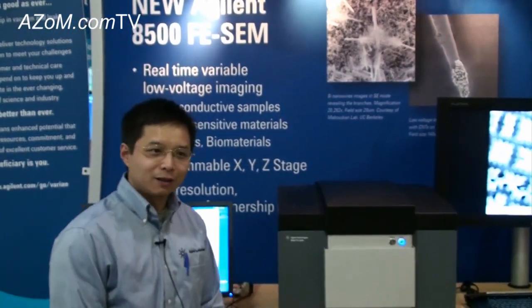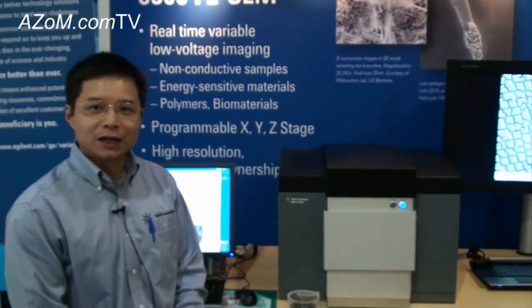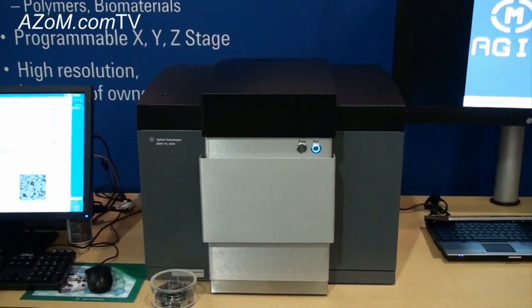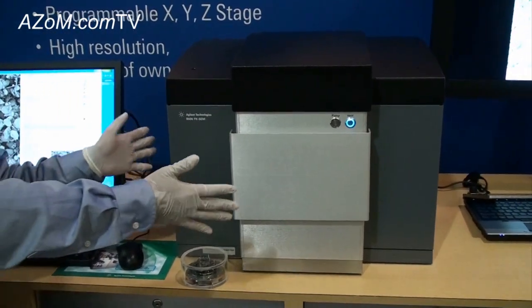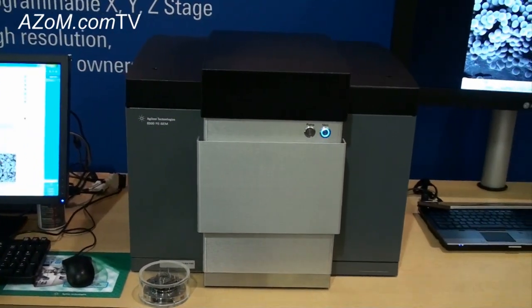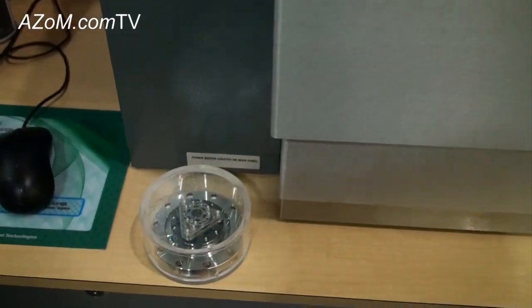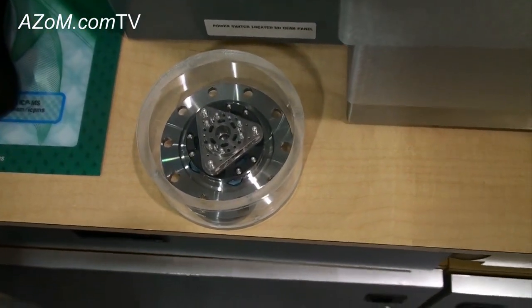My name is Xining, I'm an application scientist from Agilent, and this is our new Agilent 8500 FE SEM. This is the first market-available compact field emission SEM on the market. You can see this is the dimension — very compact size — and we have very unique technologies which include MEMS fabrication to fabricate all-electrostatic lenses.